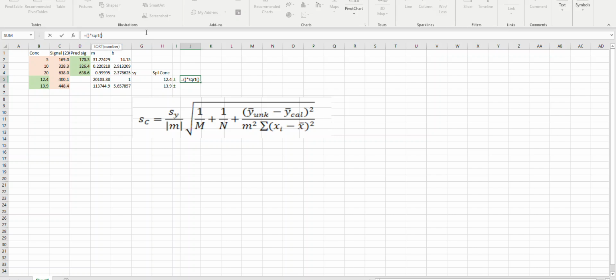Now, if I go into the second term, I'm going to have, in turn, 1 plus 1 plus third term, right? And then the third term is going to have a numerator, which is squared, and a denominator. I'm going to go ahead and put the denominator in parentheses as well. So let's go ahead and start filling these guys in.